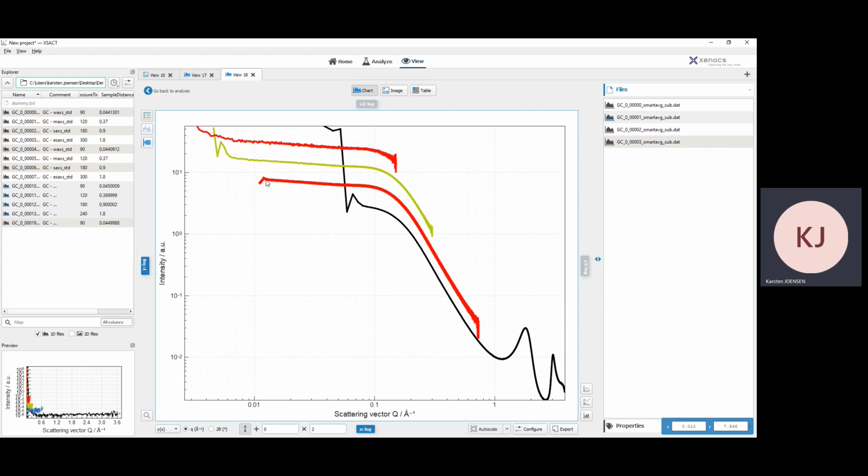We have a better subtraction of the data there, but still it's visibly not, these last 2 points here are visibly not good with that. Then we've got this one here, again, coming up to here, and finally the last one where we begin to see a sort of a rise in the low end of that. So this was just to get those separated.